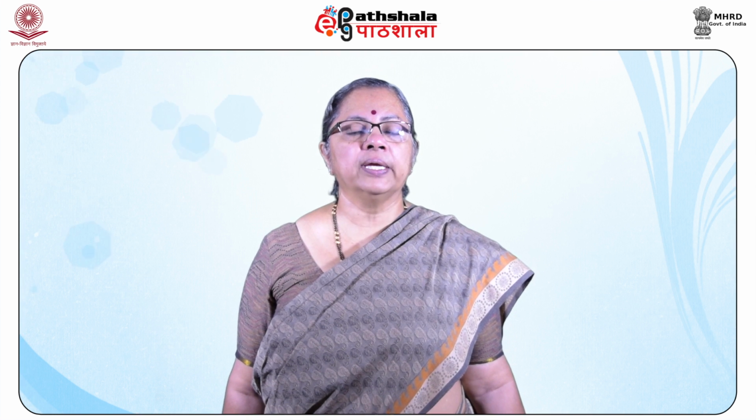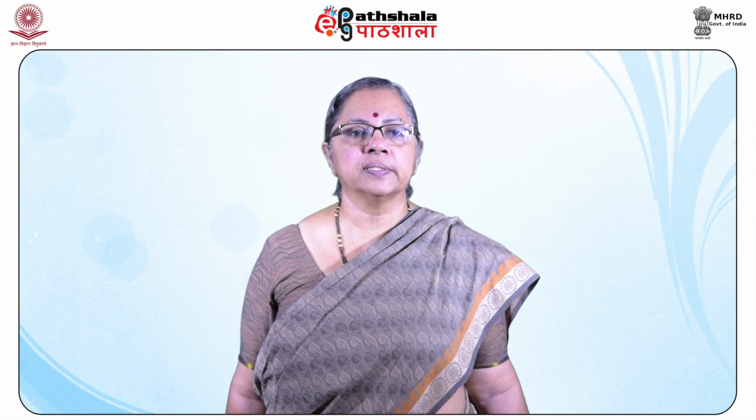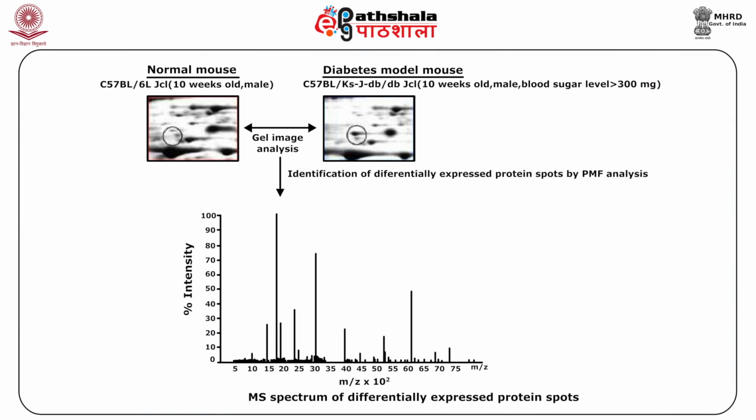Databases of various proteomes can be maintained and made available for comparison. The figure illustrates the use of mass spectrometry in analyzing a proteome. It indicates the MS analysis of a proteome after 2D analysis from a normal and diabetic mouse.